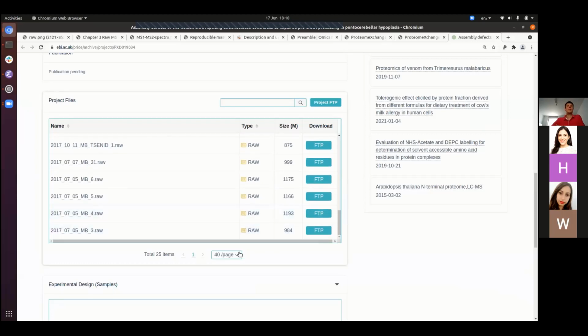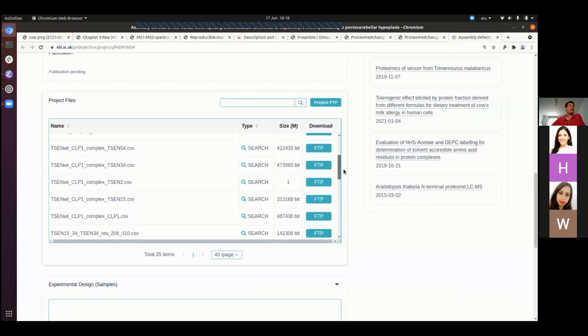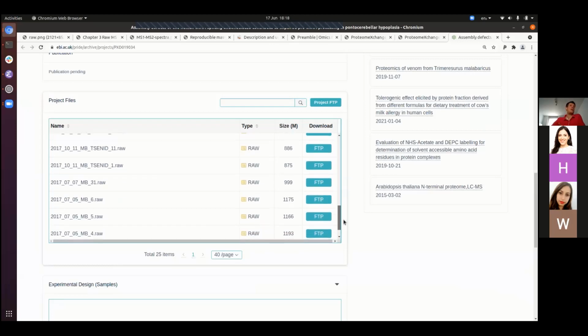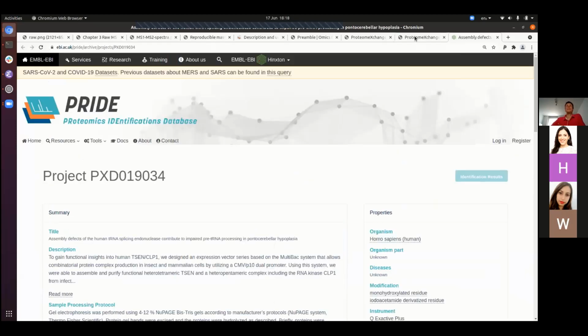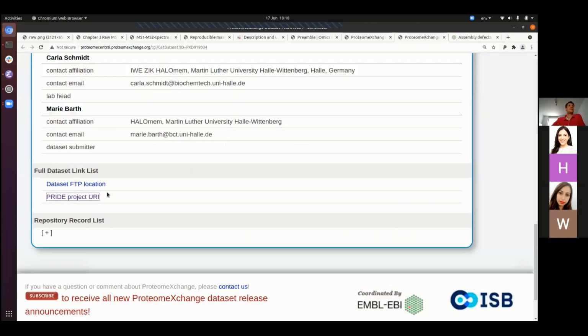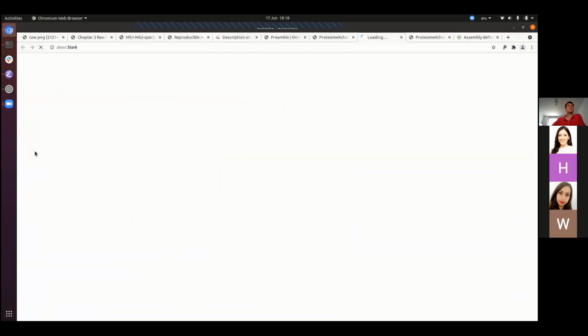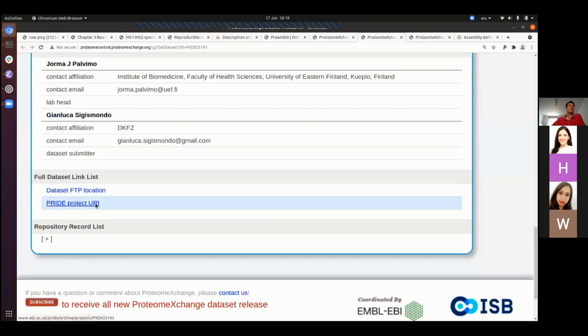Raw. Is that all they have? Apparently, yes. So apparently here, or maybe I would need to look at these CSV files, but it doesn't look like there's a straightforward way to find the annotation of these samples. I have been a little bit unlucky. Let's see if I try another one. Let's try this one. But normally what you would expect, right project here.